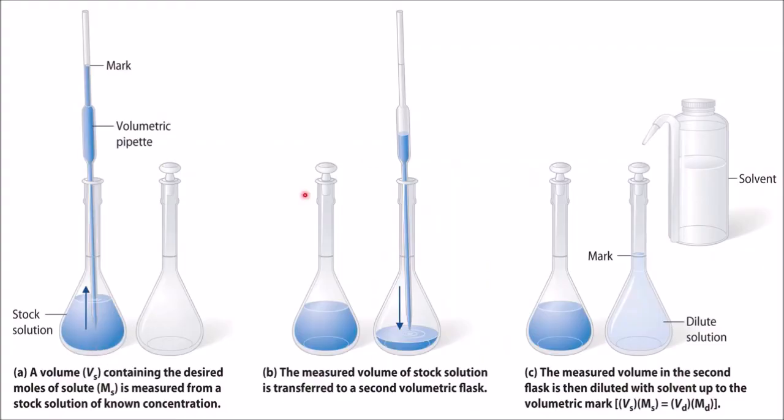Next step is how do you actually perform a dilution? I will try and see if I can make another video of a dilution process, but if I can't, you can always search it up on YouTube. So dilution is very simple.